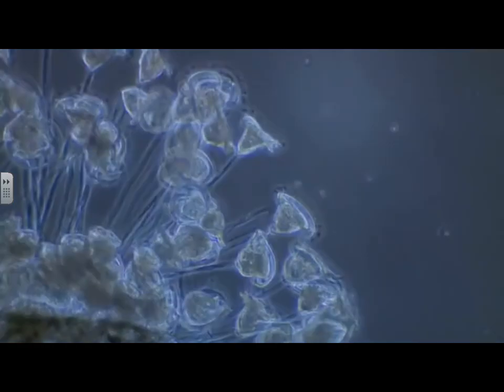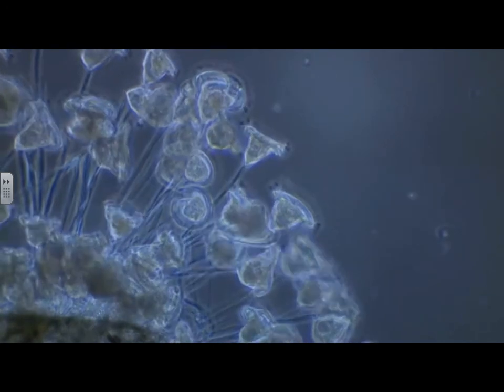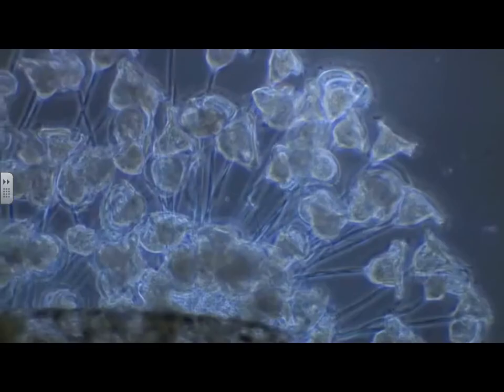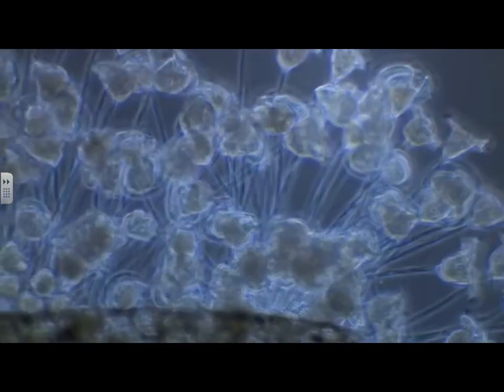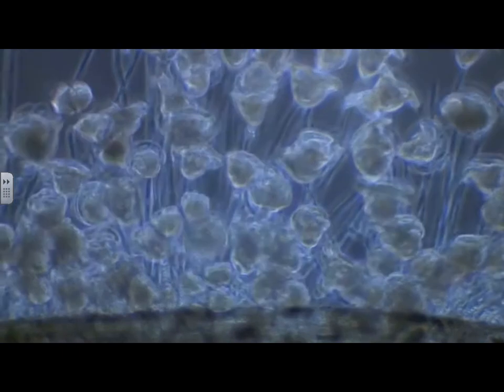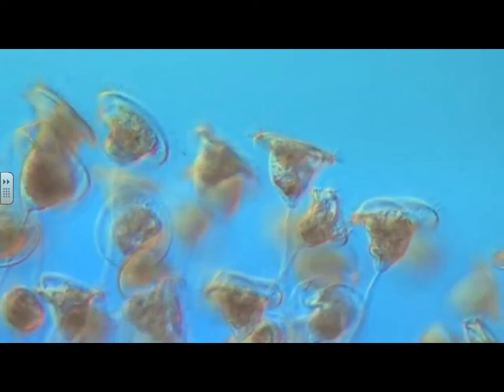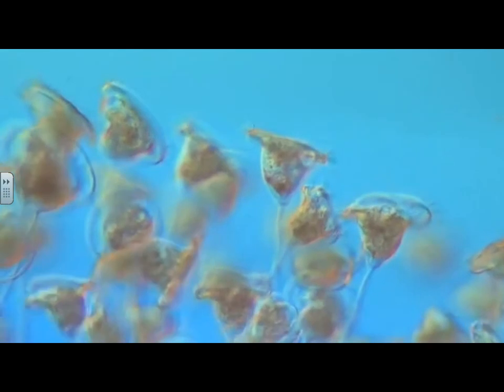Now, this is very much what Leeuwenhoek would have seen. He would have seen these things living in one droplet of water. Does peroxide kill this stuff? Peroxide doesn't. I have cuts on my fingers. Now, these are only found in fresh water.